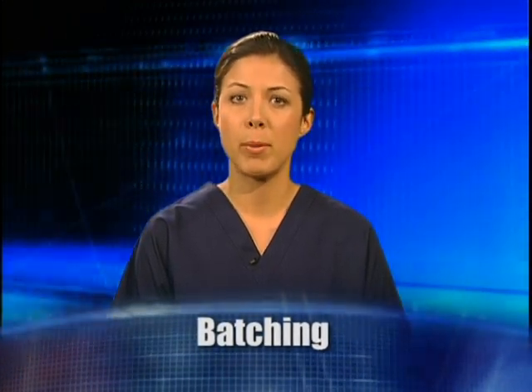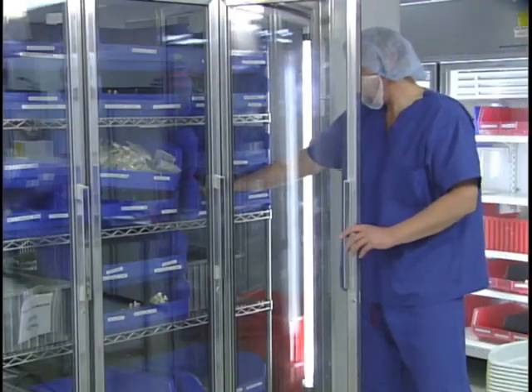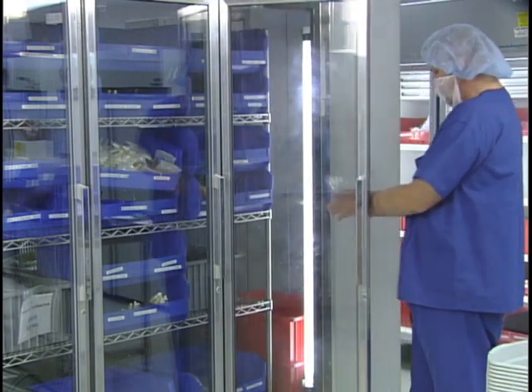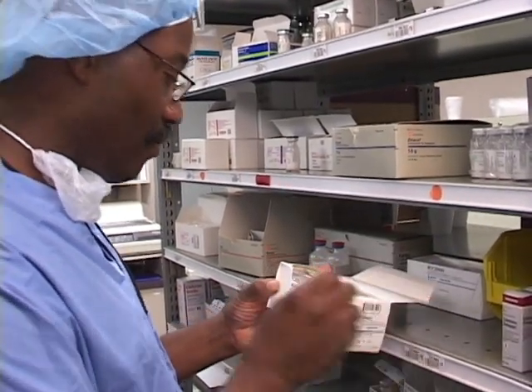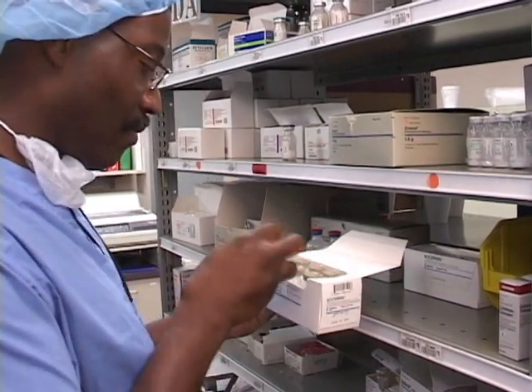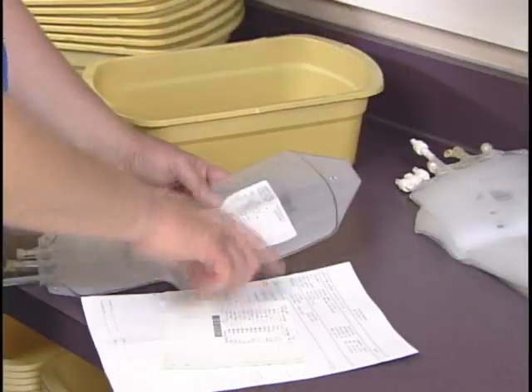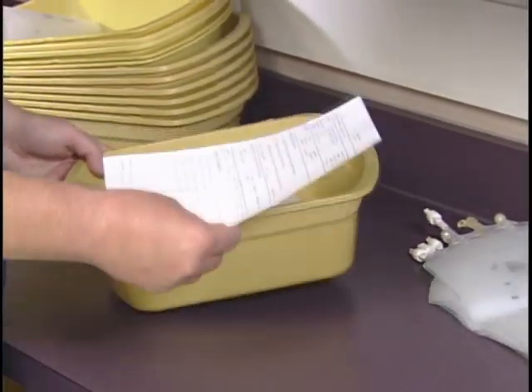Batching is the process of preparing multiple drugs that will be needed during a specific period of time. The process is as follows. A setup technician collects drugs, records, labels, and other items that are not stored at individual workstations and will be needed to batch a certain preparation. The collected items are placed in a bin and left on the setup counter, ready for a technician to take to a laminar flow hood workstation to compound.